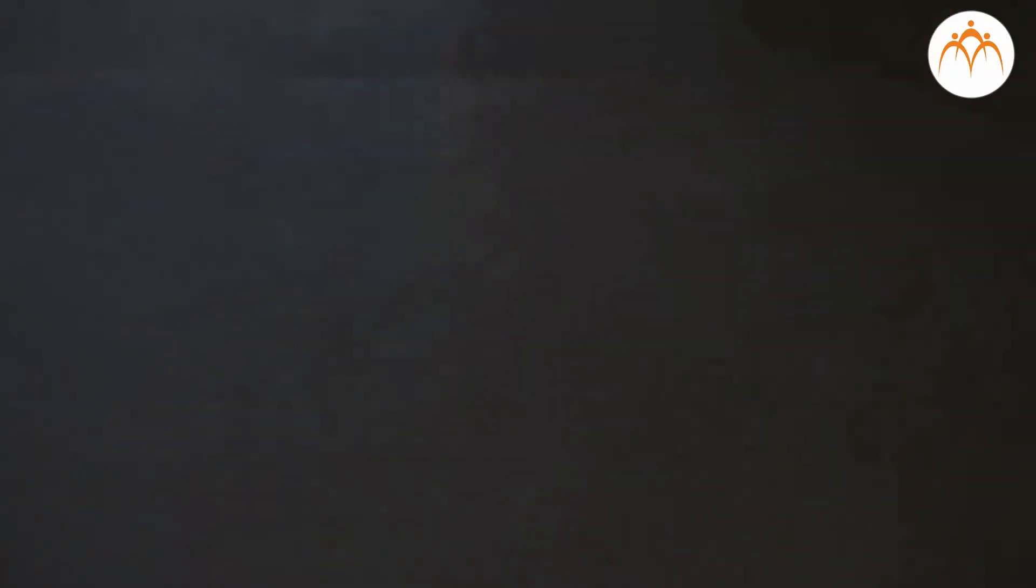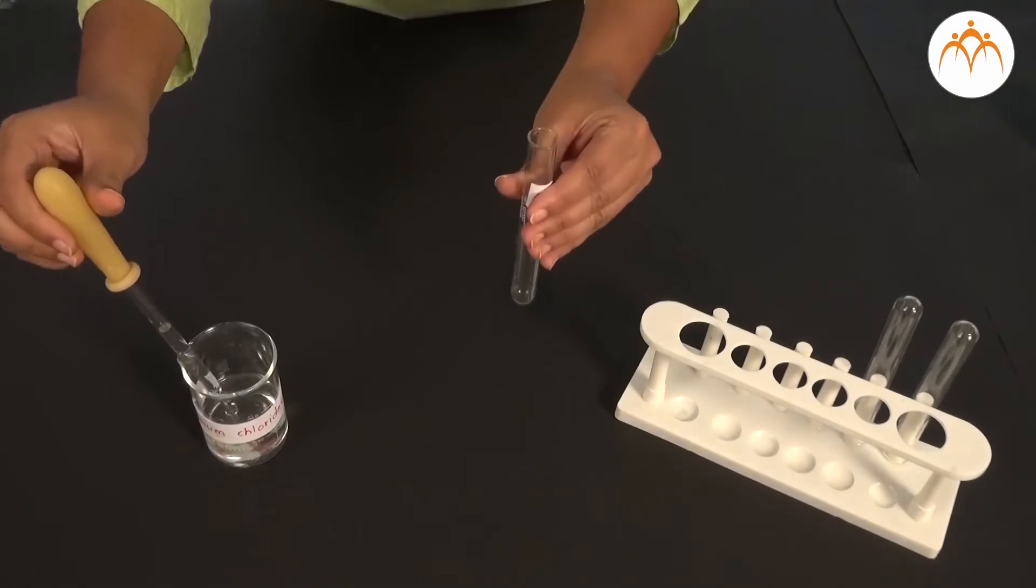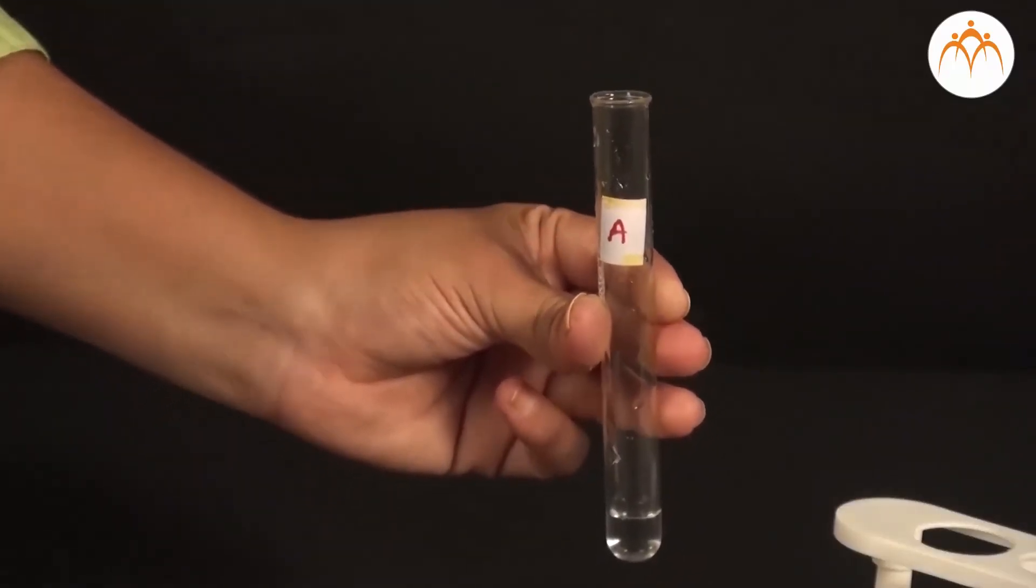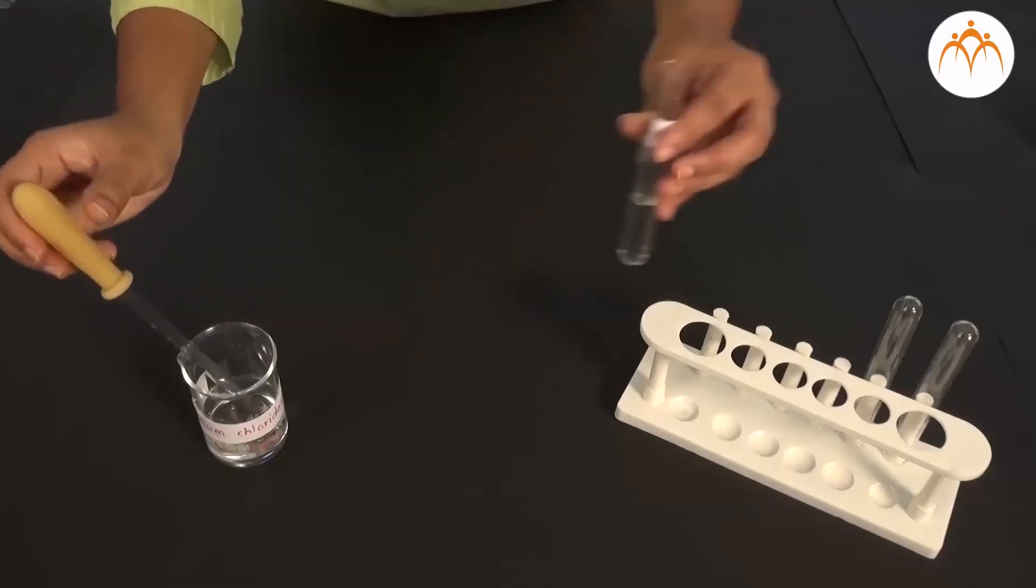Now we want to find out what they really contain. Which test tube contains chloride, which test tube contains bromide and which test tube contains iodide.